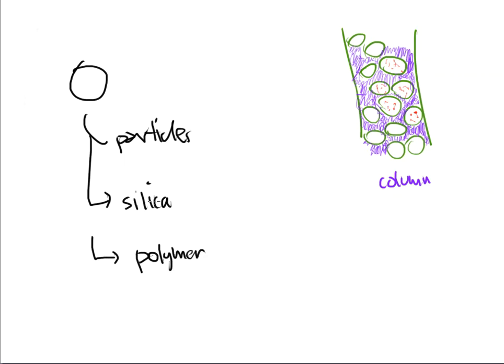Now, very early on, the silica was looked at as probably the prime choice because silica is like SiO2, and there's some polarity associated with this thing. And we knew that these were aqueous solutions most of the time. And aqueous solutions basically means the solvent was water, and water and polar mix. And they thought that the silica could do a very good job in separating and handling the aqueous mobile phase. And it does. It actually really does.